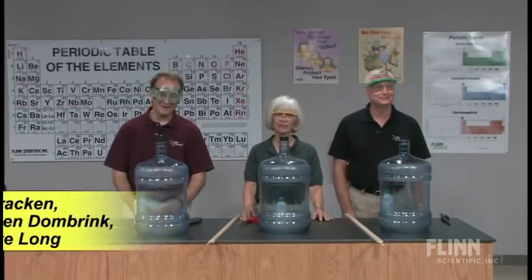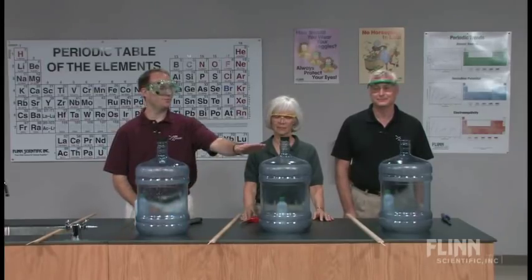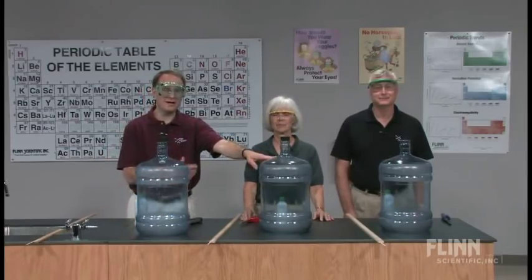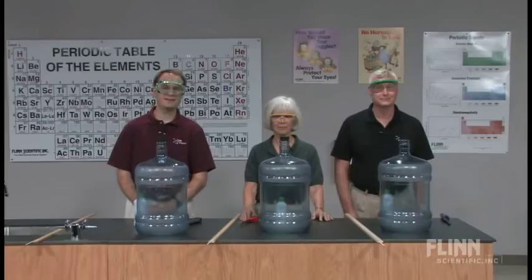The Woosh bottle is a very popular demonstration and there are a couple different ways you can do it. The approach I'll be showing you involves the use of 70% isopropyl alcohol. Kathleen will be using 100% isopropyl alcohol and Steve will be using 95% ethanol.